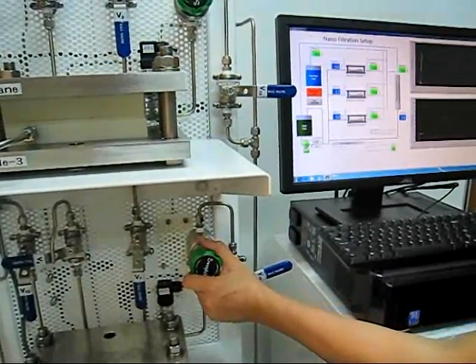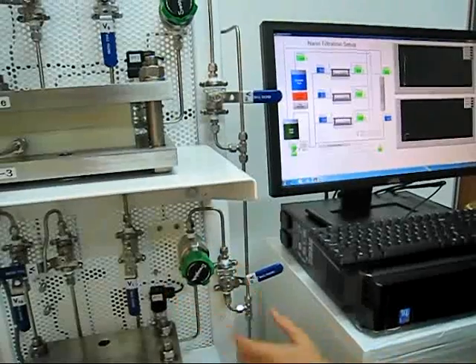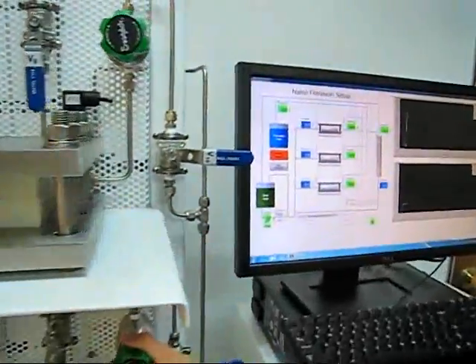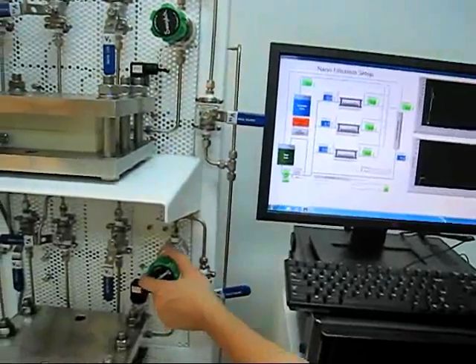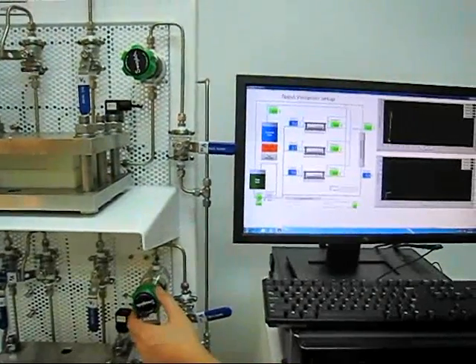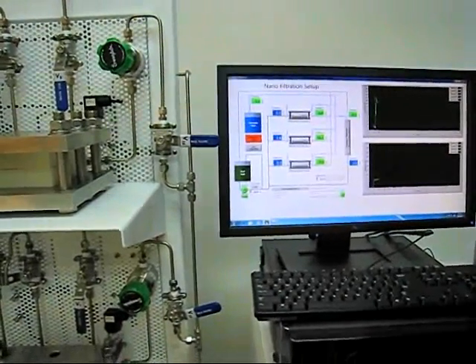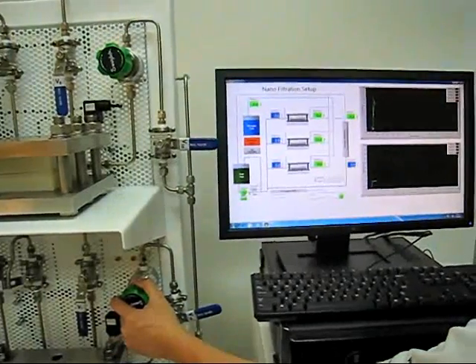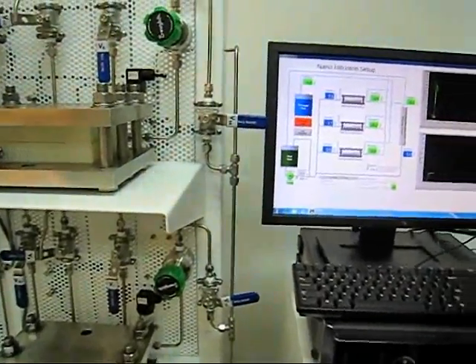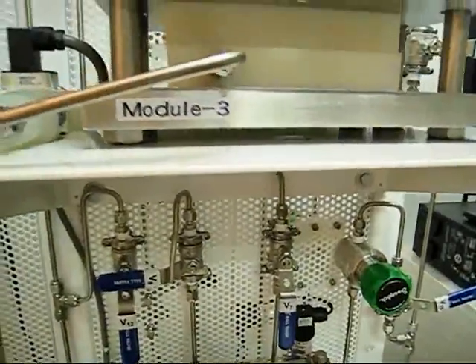9.5 — a bit more. I will leave it there at 10 bar. Just leave it there. You realize that I am at 10 bar. The flow rate across the membrane is 3.7. I am going to collect some permeate from the system right now.